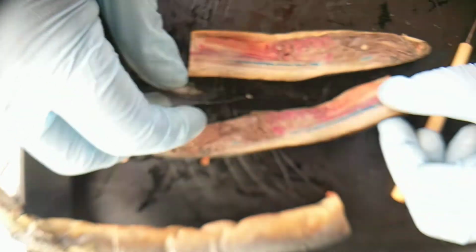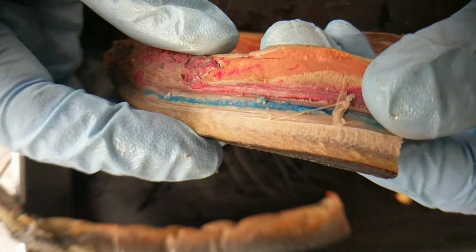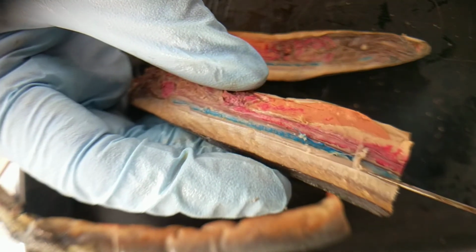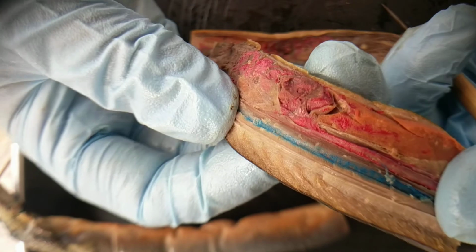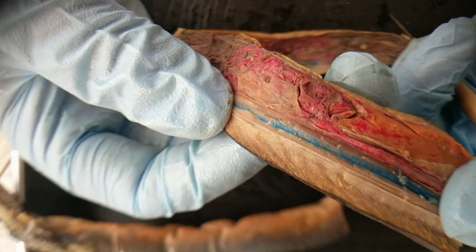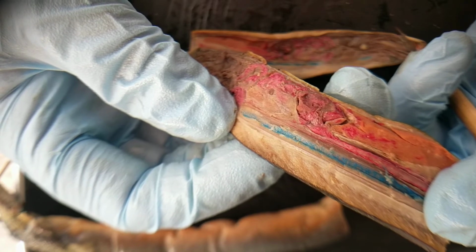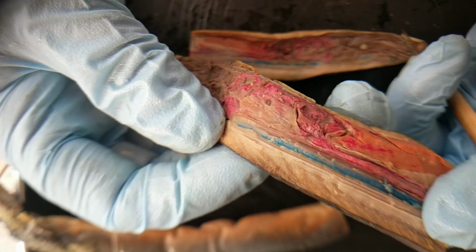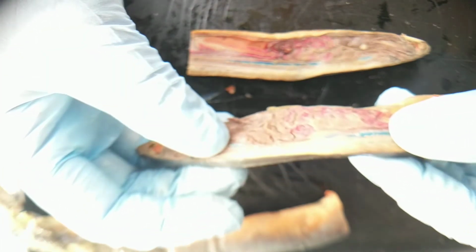What else? Oh yeah, I wanted to show you the myomeres. If you look above the notochord, here the notochord gets pretty thick. Look at that nice thick notochord there. And then above that you can see this is muscle. I don't know if you can see that well here, but you can kind of see it in the light. See how there are segments? Each of those muscle segments is called a myomere. If something has myo in the name, it means muscle, and then there are myosepta between them. So separating the myomeres are the myosepta. I think I got everything that I wanted to show you on that one.